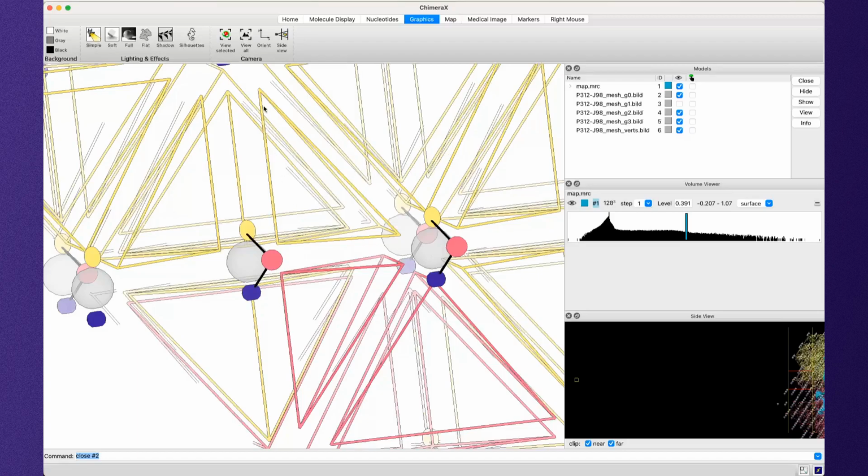Here I've shrunk the tetrahedra just so it's more visible what is going on, but remember that these are in fact connecting the vertices exactly. So if we move this vertex up here for yellow, it must move there for pink. And what that means is that any deformation that the fab has must be matched by a deformation the ion channel has, which makes sense.